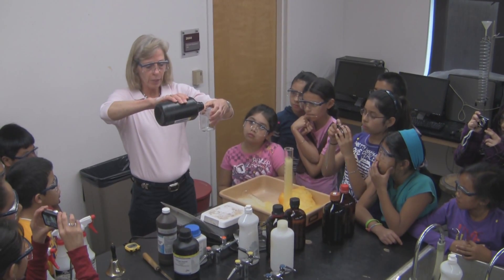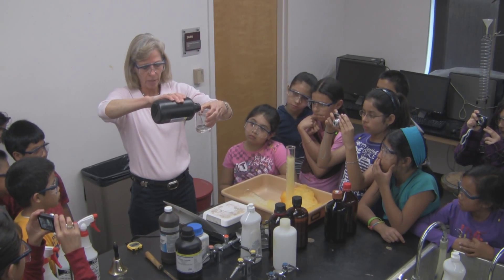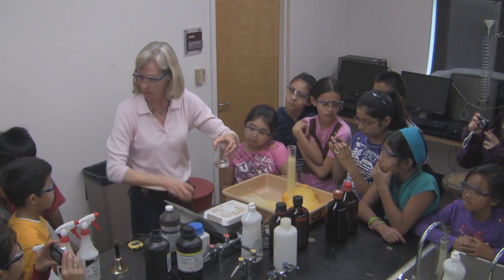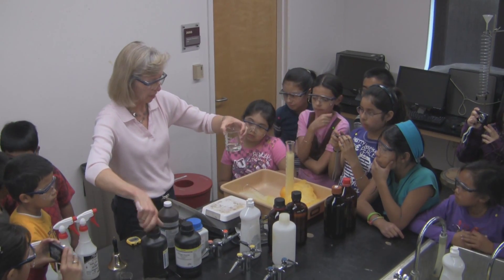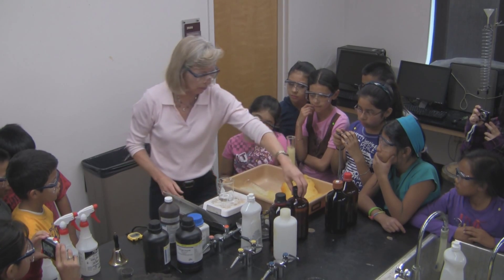I need 50 milliliters of the first solution, which is hydrogen peroxide. Hydrogen peroxide is actually in every cell of your body. Can you believe that? And you're able to make it, and then we can get rid of the excess if we need to.